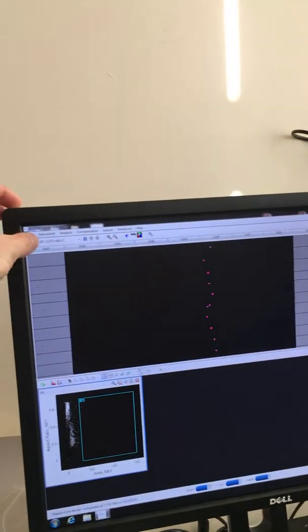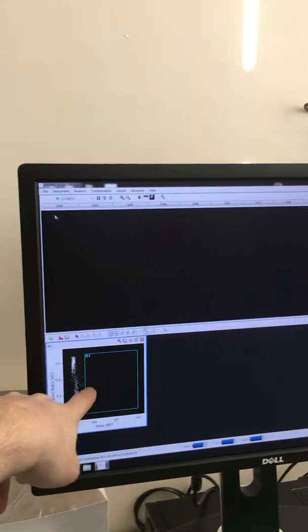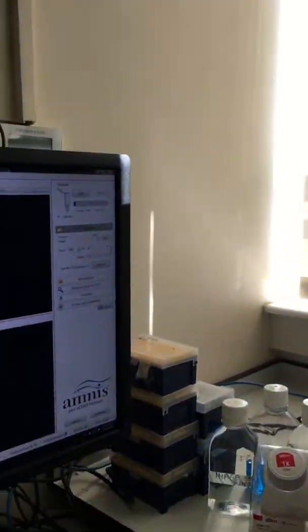And then up here you've got all. So change all view to R1, which is the region you just defined there. Now you're seeing that, and there's nothing there because the beads aren't being included. So now you want to press Show All in the corner.